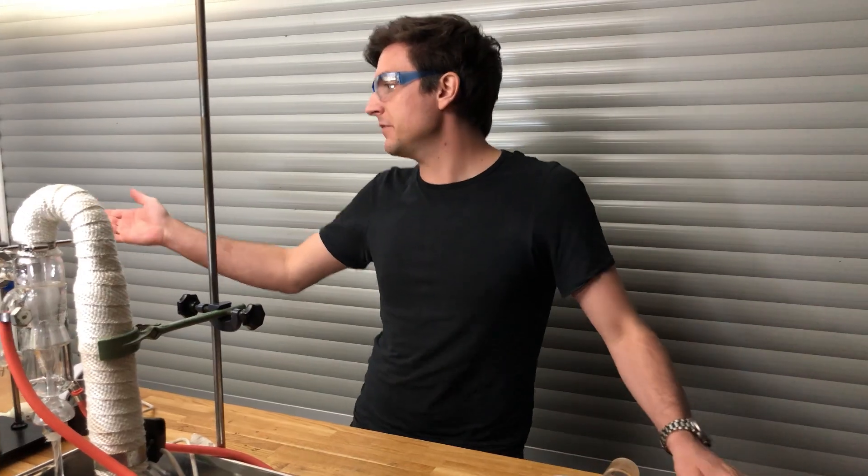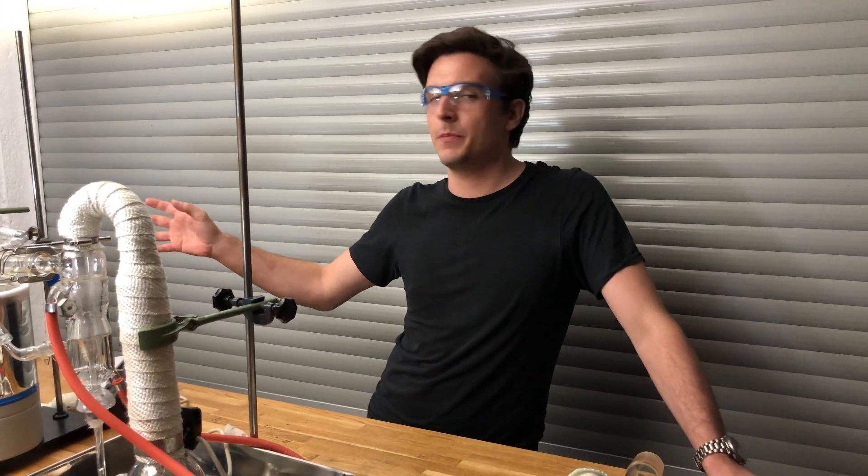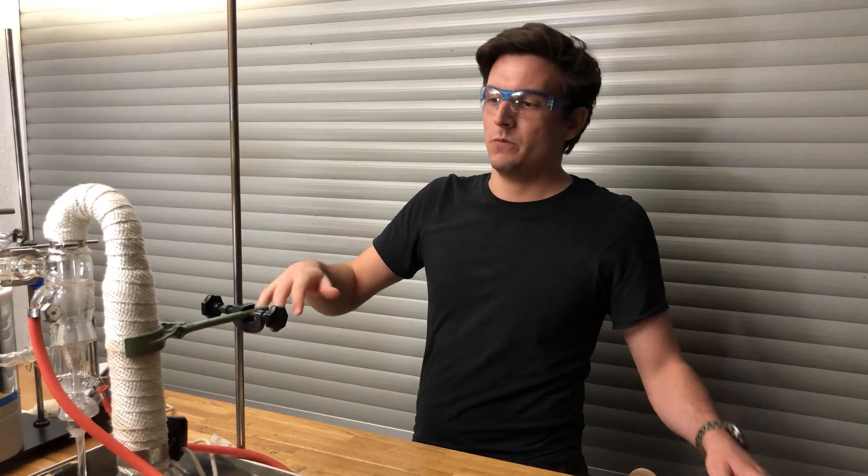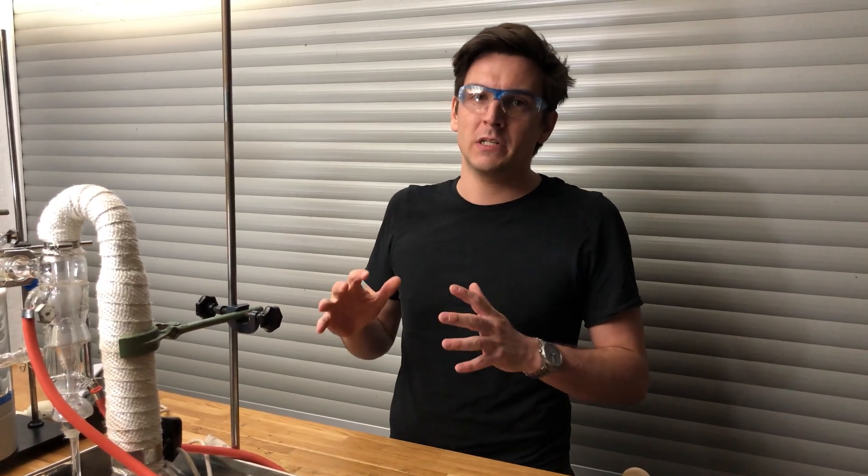We are currently at 7.33 times 10 to the power of minus 4 millibars. I think we could get lower with the appropriate connections. Maybe in the future when I set up the Schlenk setup permanently I will show it to you. But I think this demonstration was good enough to show you a mercury diffusion pump in action.